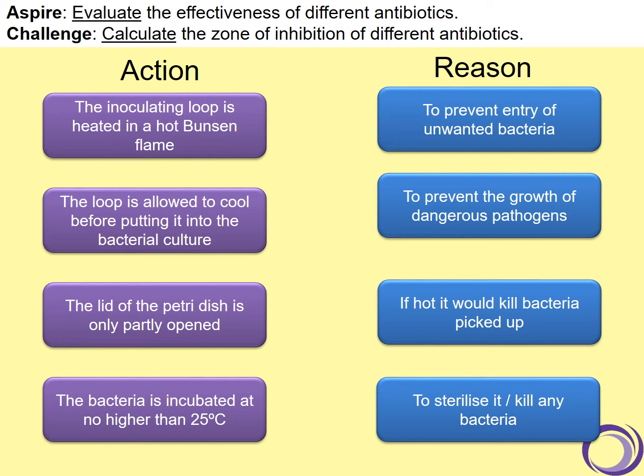Okay, you've got 1 more minute left. Right, so the inoculating loop is heated on a Bunsen burner flame, and that's to sterilize it or kill any bacteria.